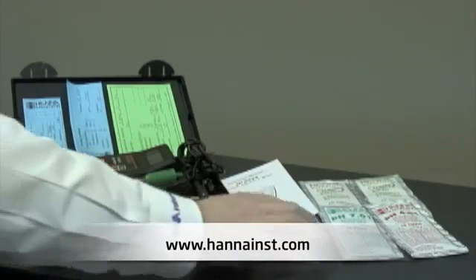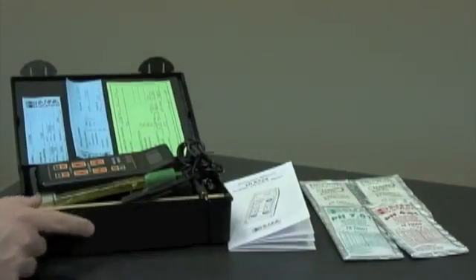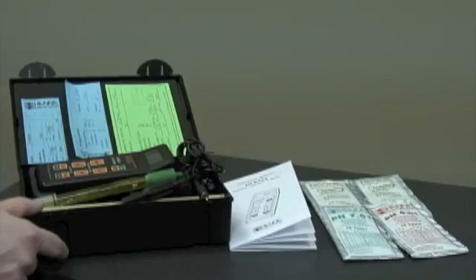You'll also receive a temperature probe, instruction manual, buffers, and calibration solution — all contained in this rugged plastic carrying case.